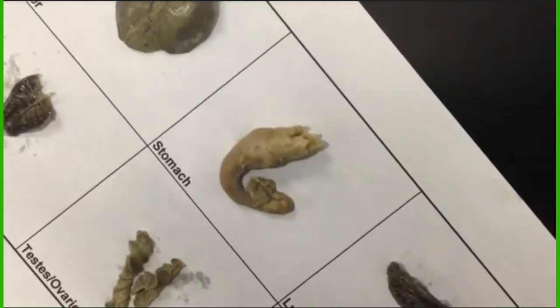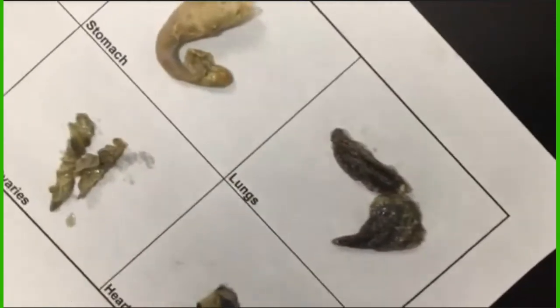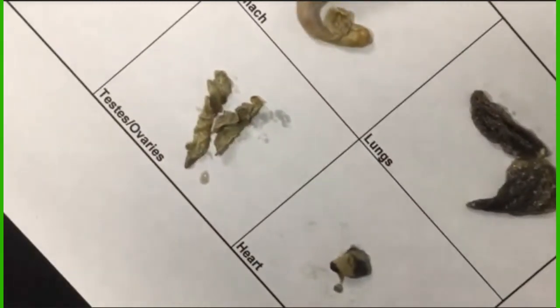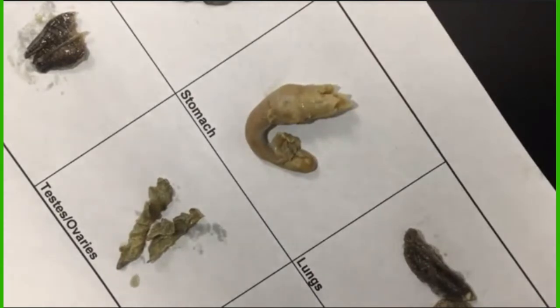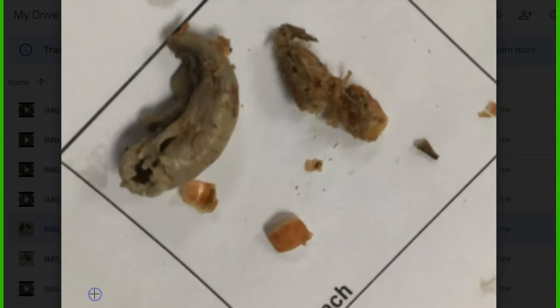Okay, so here's that paper I was talking about that the students would lay organs on. Liver, stomach, lungs. You got the heart there, and sex organs, whether it's testes or ovaries, that's what they're supposed to put there. In this case, it was ovaries. So you'll see me point to that word right there, ovaries, because that's what those are. And there's the kidneys. So that's usually what I base the lab portion of the grade on, them separating out those organs, putting them in the right spot. So here's some examples of things we found in the frogs.